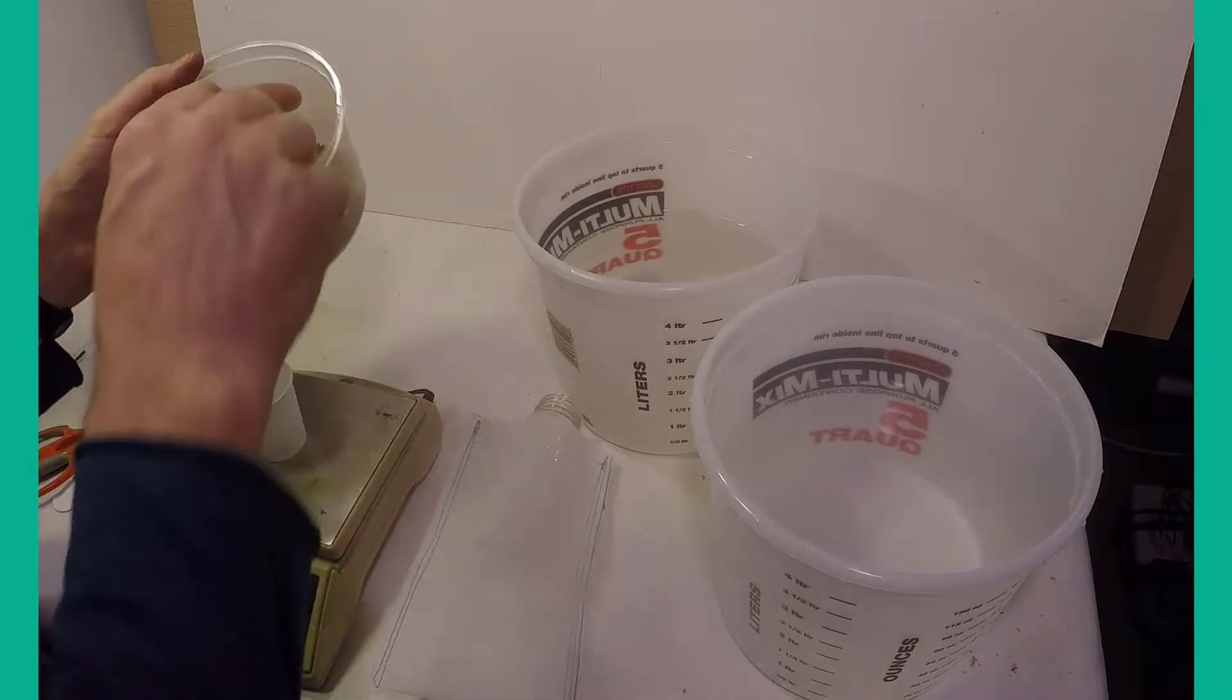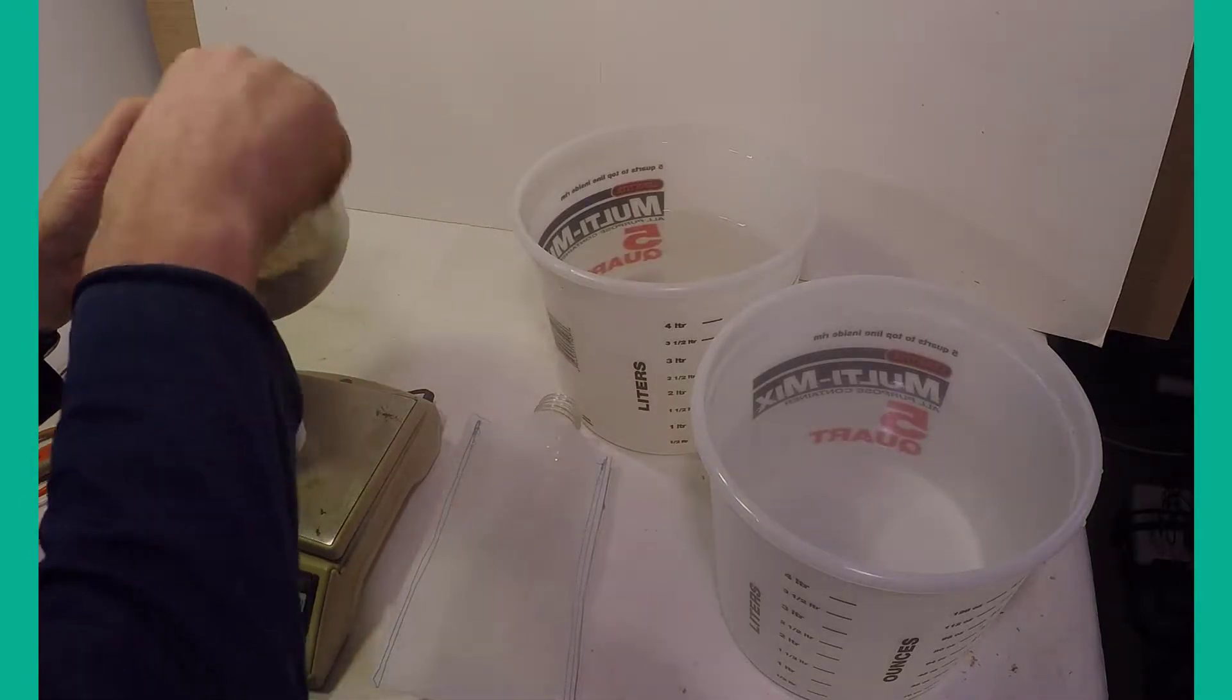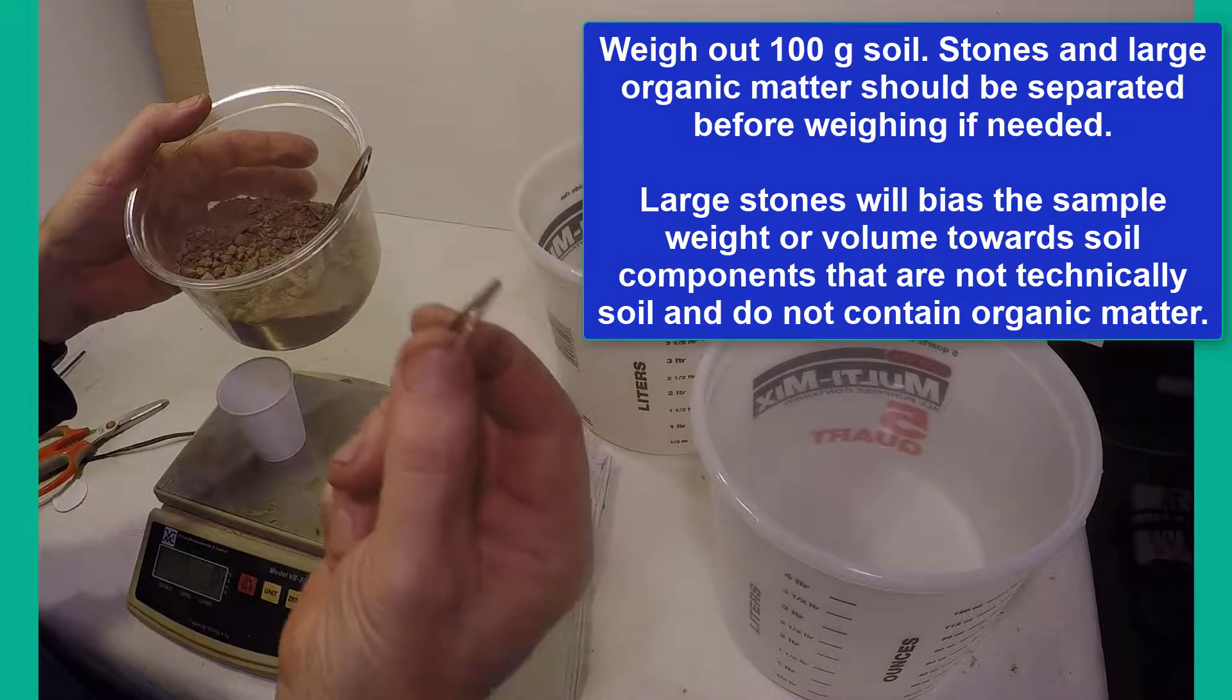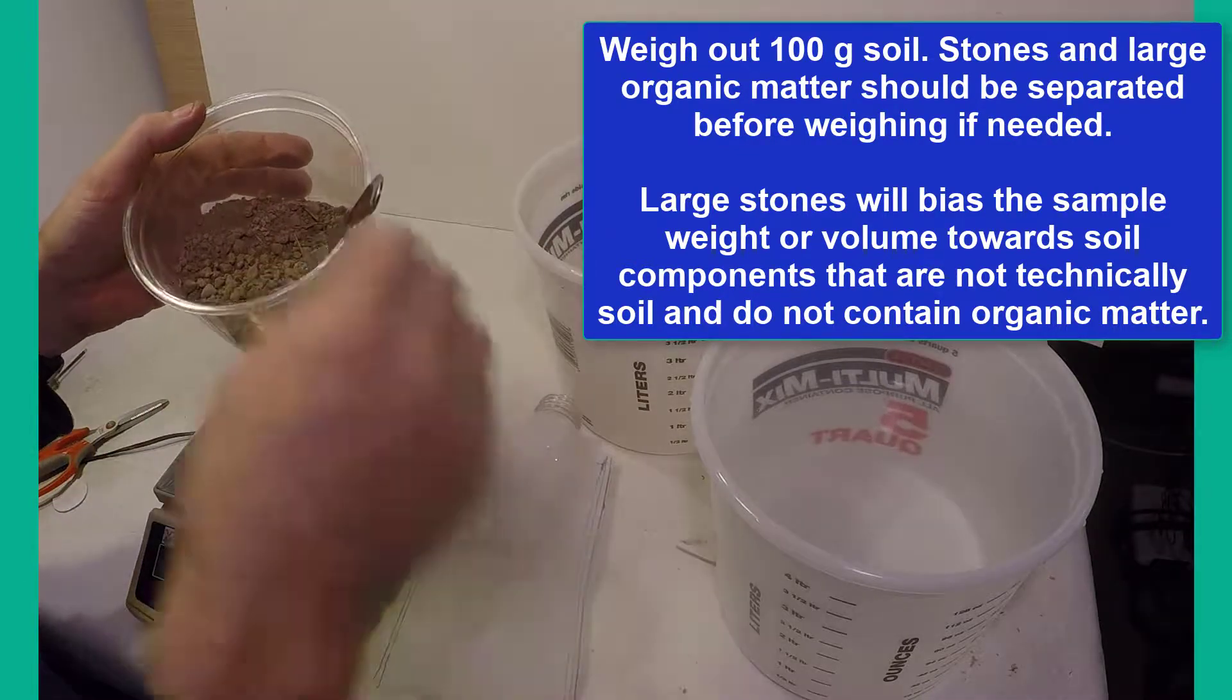First, 100 grams of soil is weighed. If the soil was not previously sieved, then you should pick out larger stones and large pieces of organic matter.